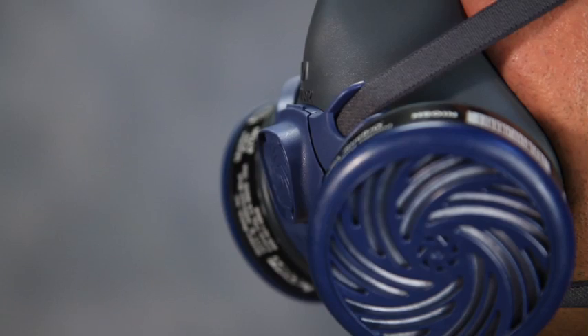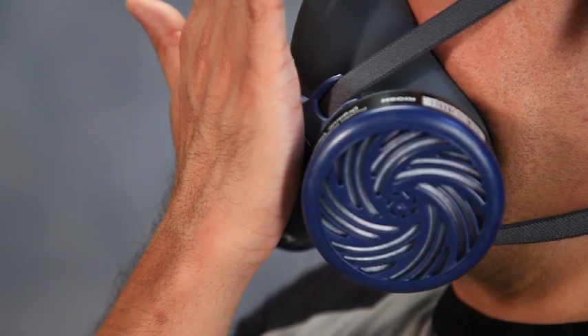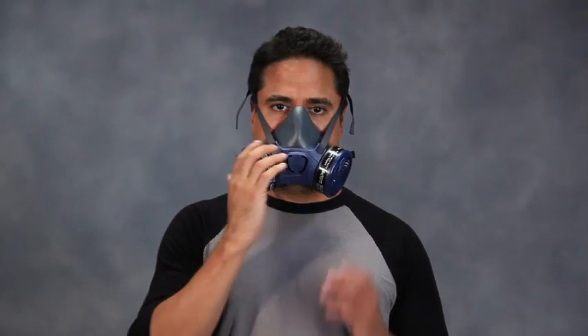To perform a positive pressure seal check, gently and without excessive pressure, cover the exhalation valve. Do not press against it hard enough to push the face piece more tightly against your face, and exhale gently to create a slight positive pressure. If air leakage is detected, readjust the position of the face piece and the tension of both head straps and repeat the seal check until leakage is eliminated.